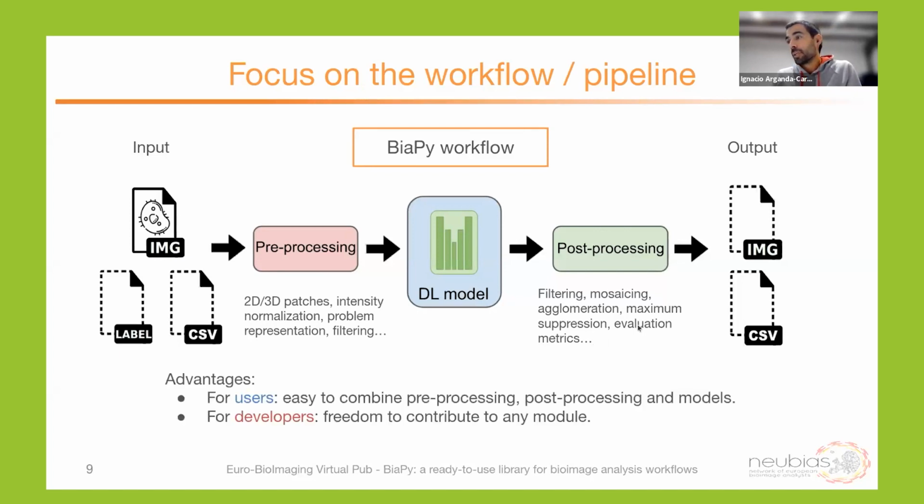So, in my opinion, we have some advantages for users, in the sense that for them, it's easy to combine methods on the pre-processing or post-processing step with these different deep learning models. We see how, and the only thing that they need to worry about is to put their data in some folders more or less organized, so the input to the whole workflow is clear.